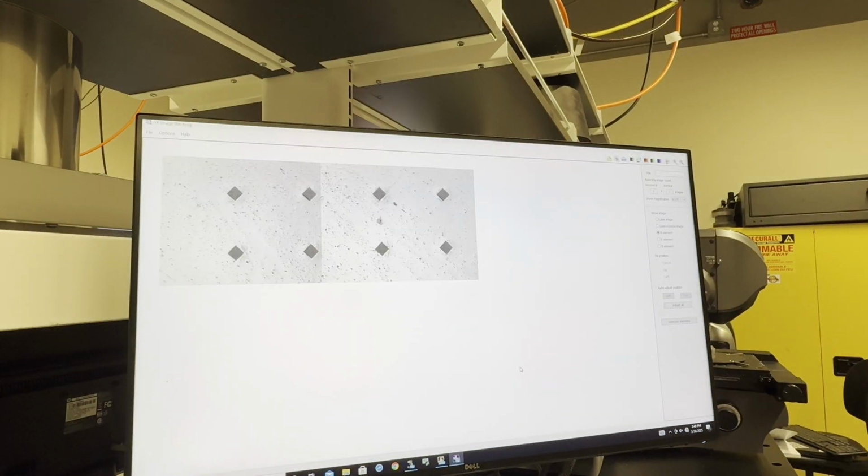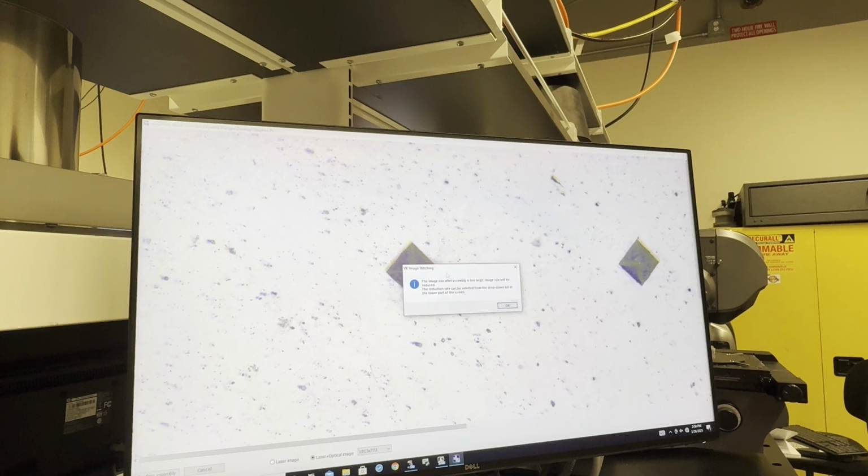As you can see, once the process is completed, it will pop up with a window where it will do the final stitches. You can position it manually, but the easiest way is to press execute all, and it will stitch the image automatically together. Usually there will be an error showing that the image is too large. It is okay to click OK on this.